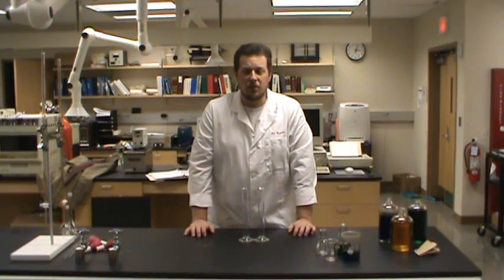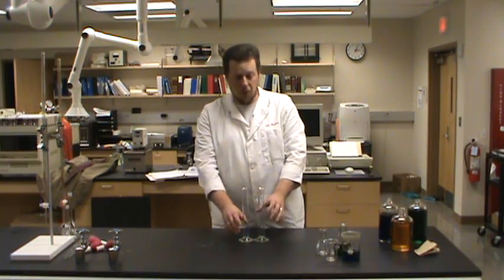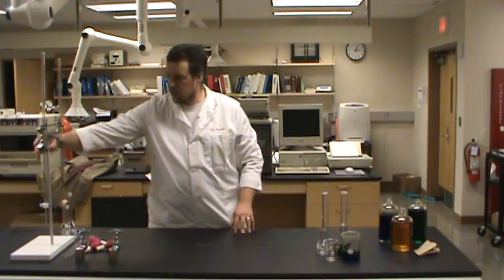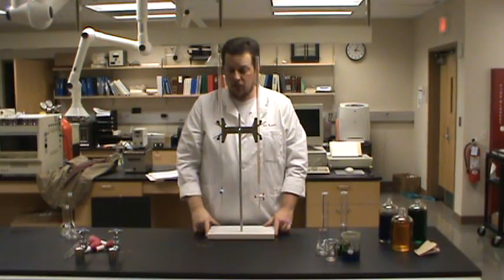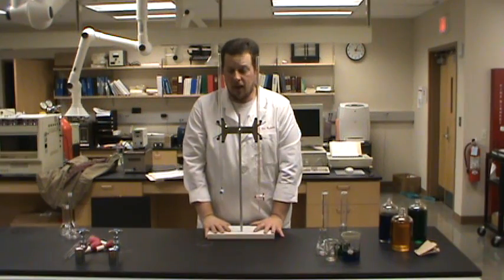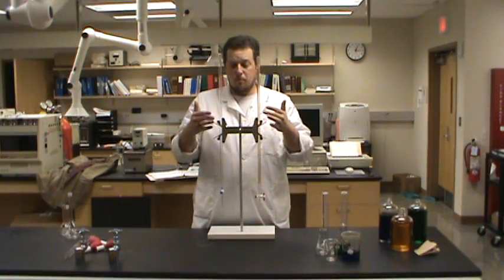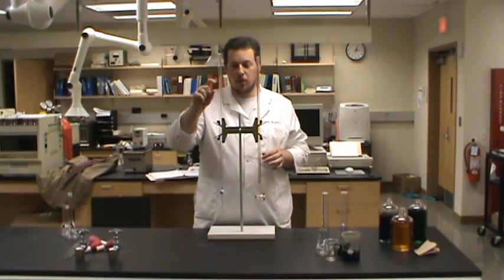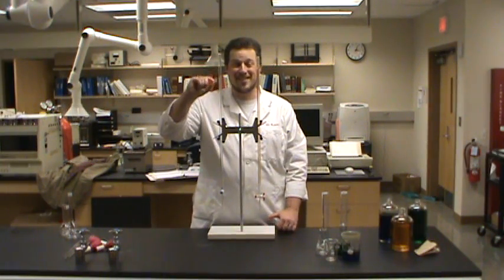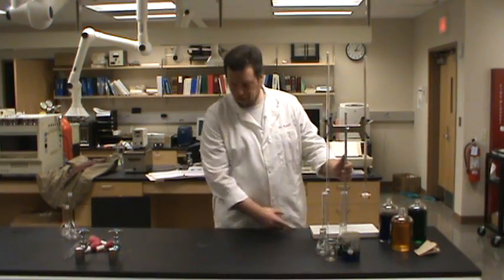Those are all really helpful pieces of equipment, but there are going to be a couple others that we're going to work with. The first one that we're going to use fairly regularly is a burette, and here I've got a couple burettes. There's another video posted that talks about burettes a little bit more. Burettes are good for measuring out approximate volumes to an exact decimal multiple times. They're also good when you're not sure how much total volume you want to add, but you want to know exactly how much you've added. So those are burettes. Again, that's another video.